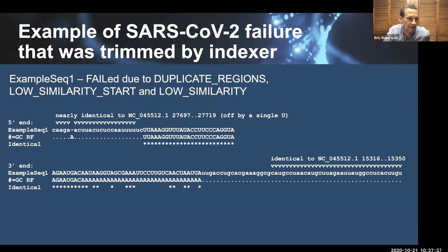There are rules in GenBank that, for example, a CDS cannot end with an N. So those positions get what we call trimmed. They get modified to the 3' most non-N, if it was at the end of the CDS, and then we add this greater than sign that indicates it's not to the end of the feature, so it's partial basically. I don't know if that answers your question. VADR should generate the annotations with that greater than sign instead of saying that it's a full length CDS.